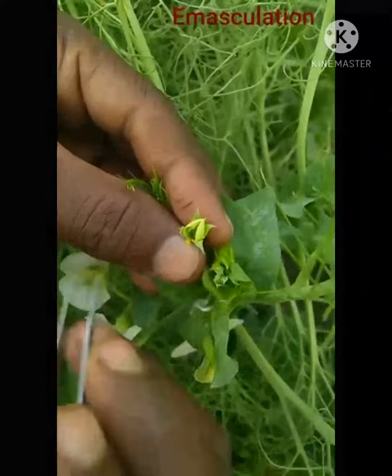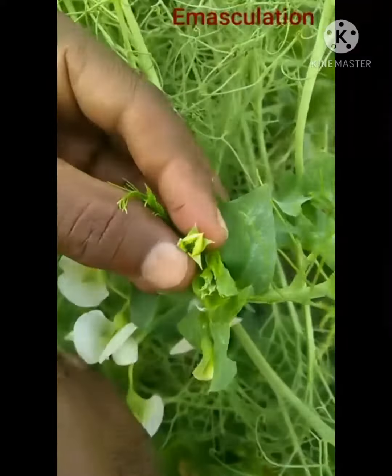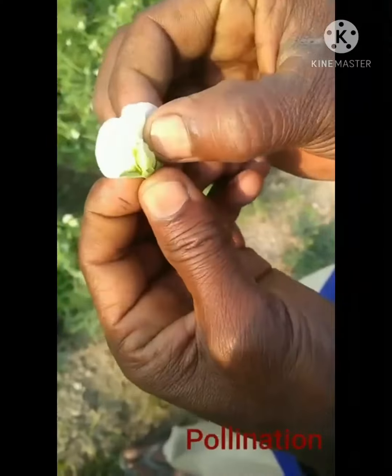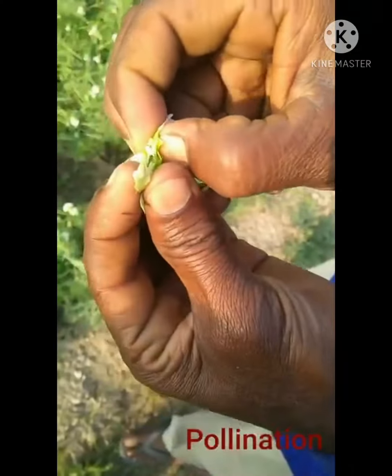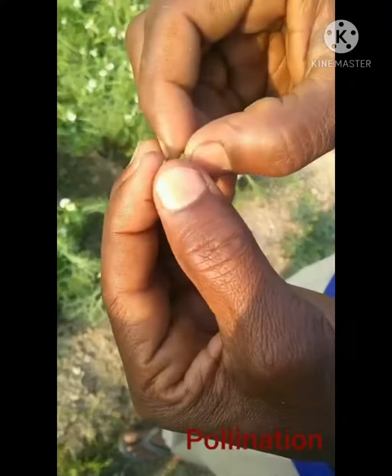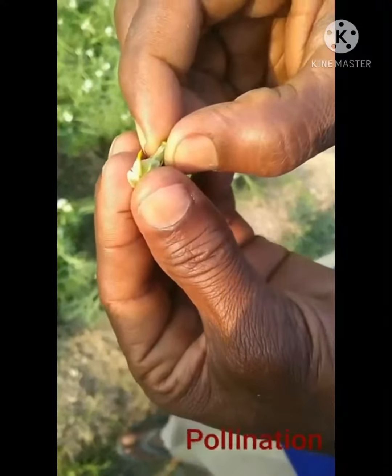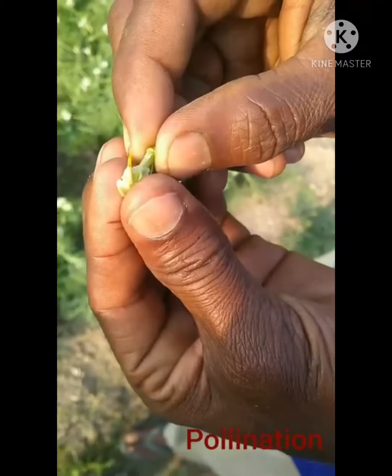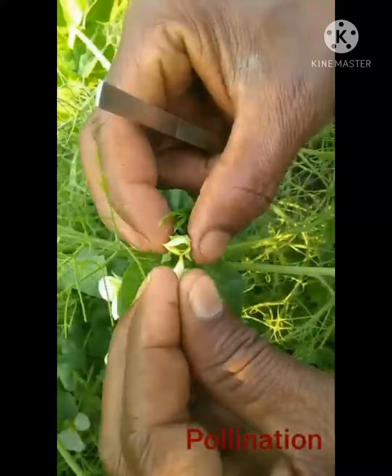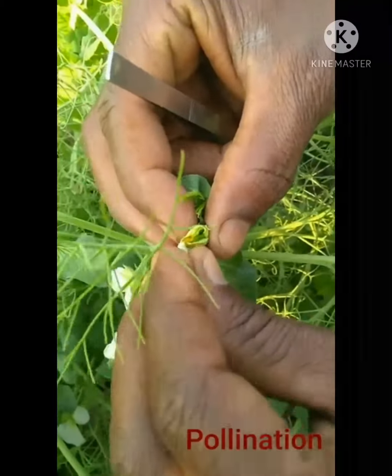Carefully extract all the pollen grains from the first flower. After that, I take the second flower from a good variety of chickpea. I open this flower and extract its pollen grains, then transfer them to the first flower.